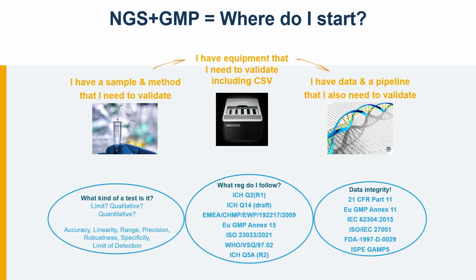So computerized system validation, I think, has been an interesting foray for the nanopore community as well. Nice to see the Q-line instrument, but someone like me struggles with the Q-line instrument simply because I still want to do R&D, but now you've locked me down in an instrument for GMP. And they don't always coexist. So it's a bit of an internal struggle I got to deal with, but it's always been in that world.